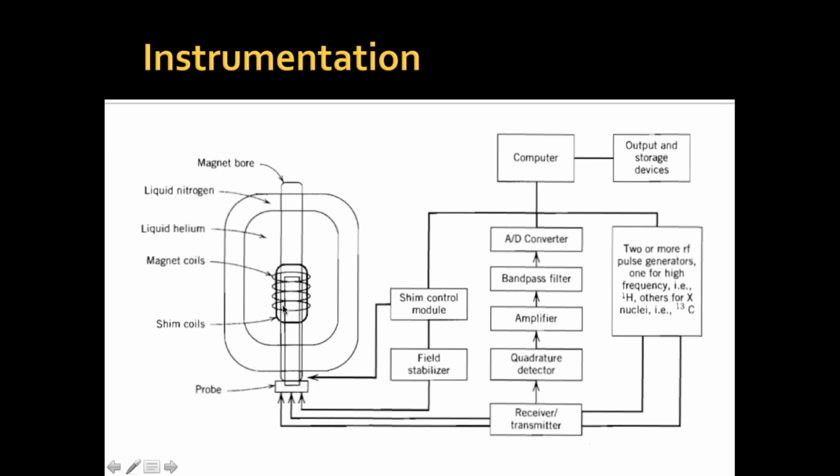Once you start the process of NMR, an intense magnetic field is generated, which rotates your sample at very high speed until it aligns with the magnetic field. The shimming coils will help to get the alignment. Now, this can be controlled manually. You can control how you are shimming your sample.